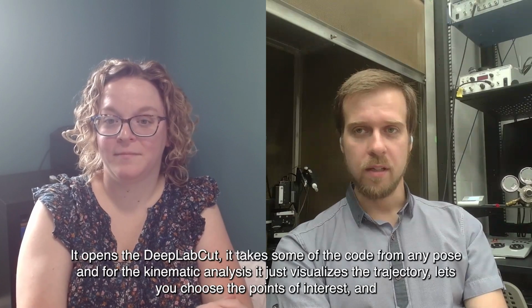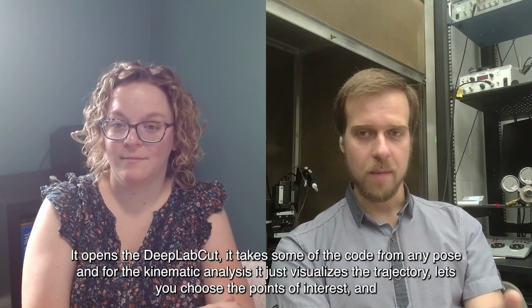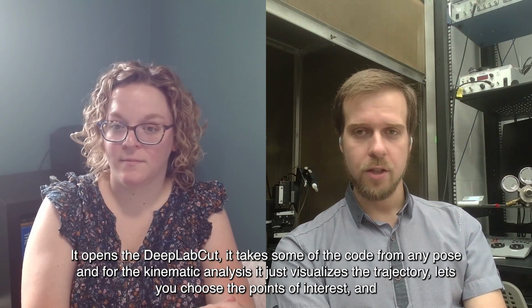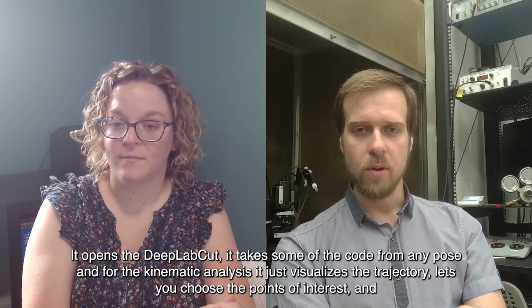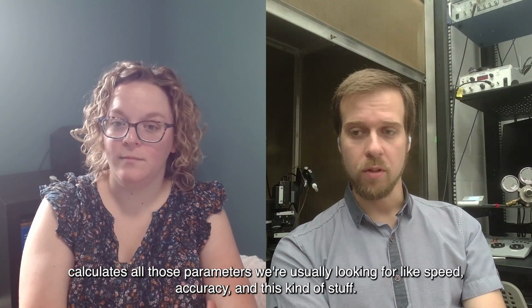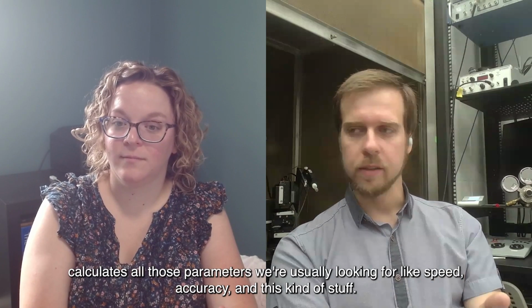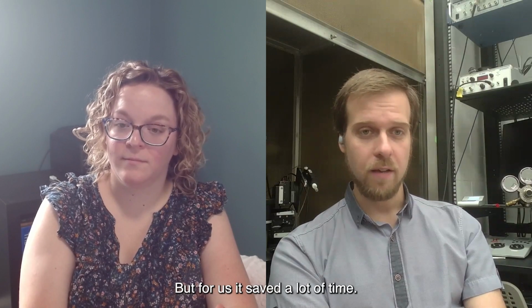It opens DeepLabCut, takes some of the code from AniPose, and for the kinematic analysis, it visualizes the trajectory, lets you choose the points of interest, and calculates all the parameters we're usually looking for, like speed, accuracy, and this kind of stuff. For us, it saved a lot of time.